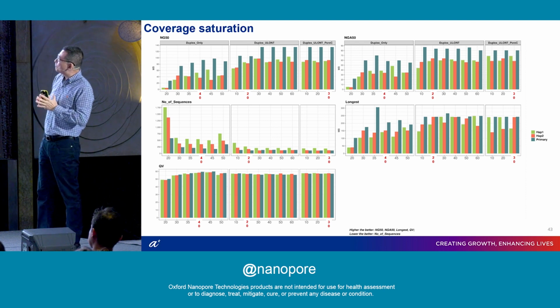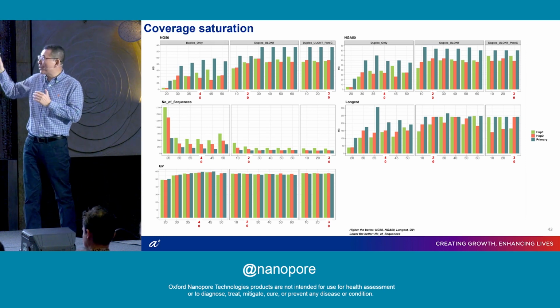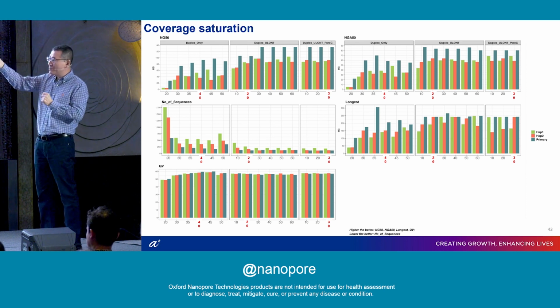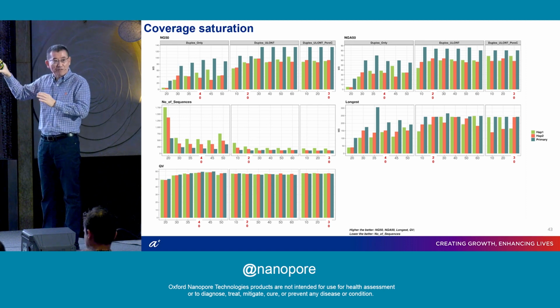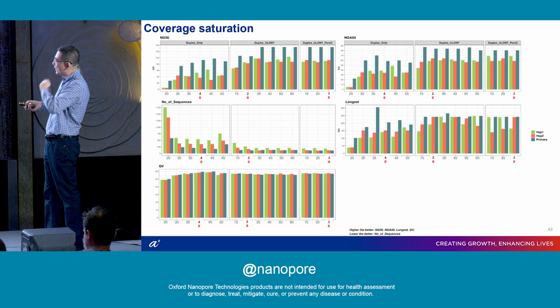And for the Pore-C, based on this number, it looks like we definitely overshoot already. So it looks like we don't need that much Pore-C data with the 30x, because you can see even with 20x, you don't see a difference between 20x and 30x. You can see, look at the number of sequences. The sequence here means a contig, and how much you can reduce the number of contigs, because the smaller number is good. Then you look at the QVs, the quality of the assembly sequence. They are basically not changing much afterwards.